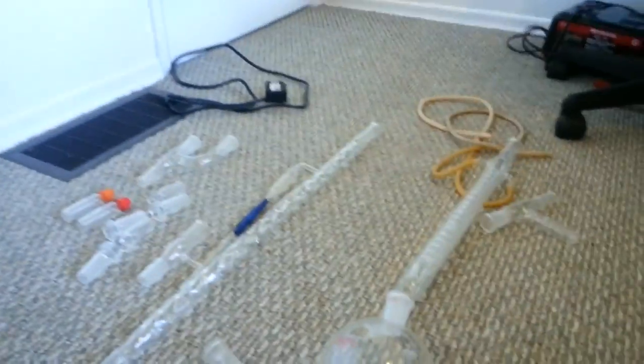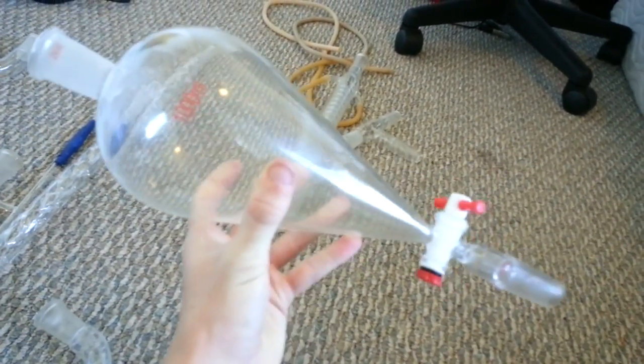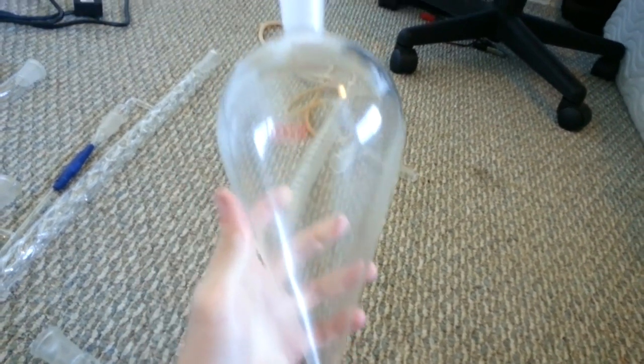Another round bottom flask — two neck, 1000 milliliter. This is a separatory funnel. What you do is you put liquid in this, shake it up, and it will separate — which is pretty good. Get one of these; this is a 1000 milliliter. You can get bigger or smaller, whatever you want.